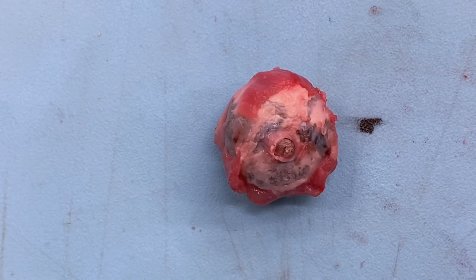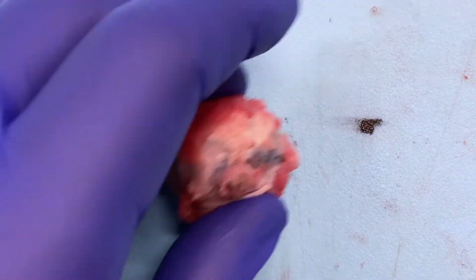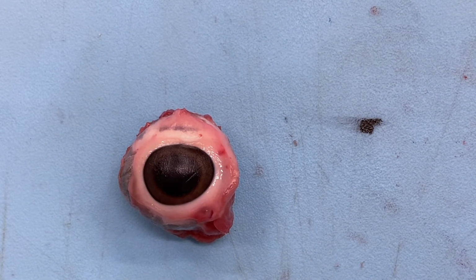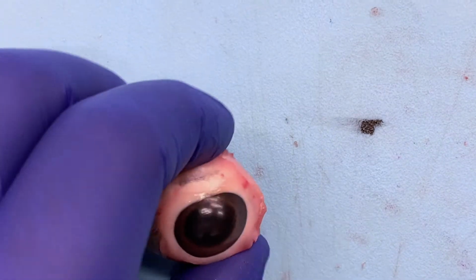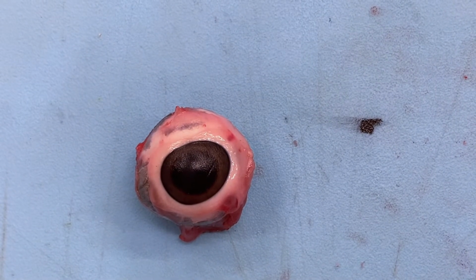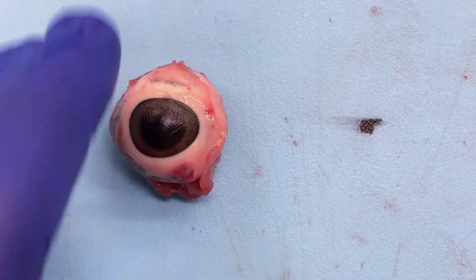Typically with these specimens, you're going to stick it in formalin for about 48 hours. Some places will only do 24, but 48 hours, essentially 2 days, is the optimal time to get these fixed. The reason for that is once you open these specimens, the retina particularly is very prone to detaching. But we don't want that to detach during grossing because that could make us miss a pathology that might be there.